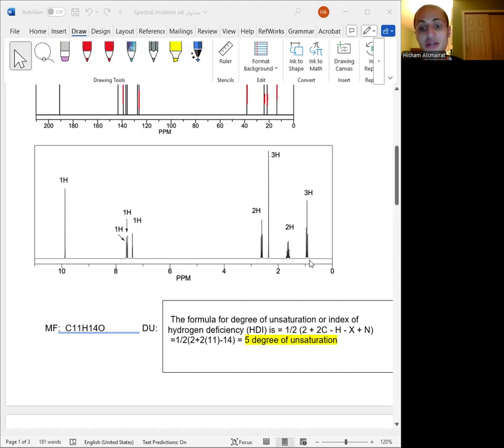By the way, this is the terminal CH3 of an n-propyl group. Over here, we have the 1.70. Integration is 2H, multiplicity is sextet, and interpretation is 5 hydrogens, meaning it sees 5 neighbors, 2 on one side and 3 on the other. This identifies the middle CH2 of the propyl chain.